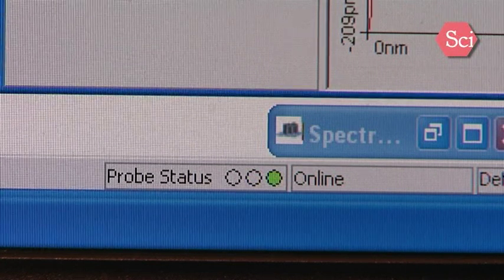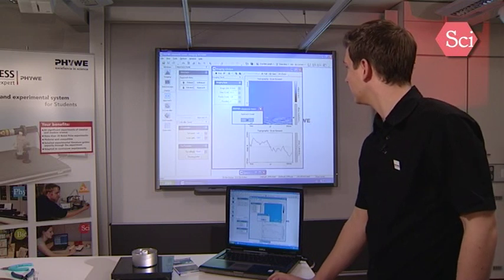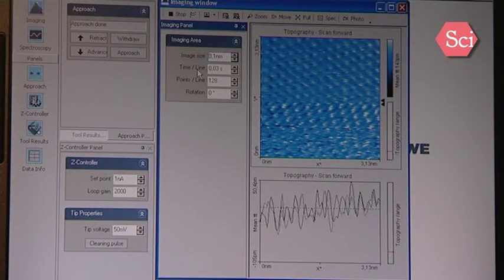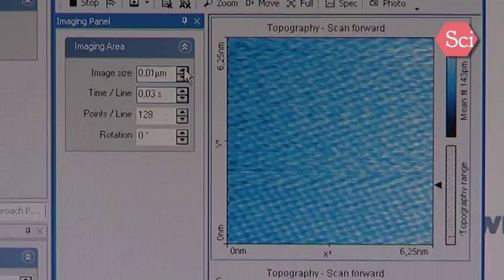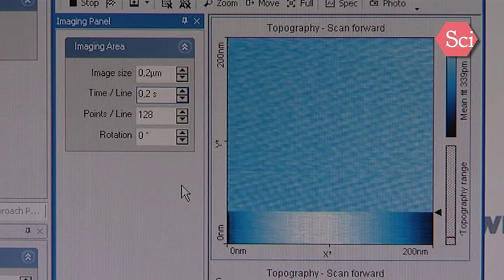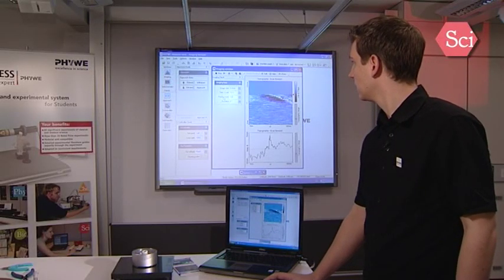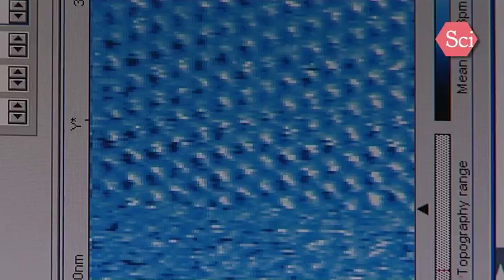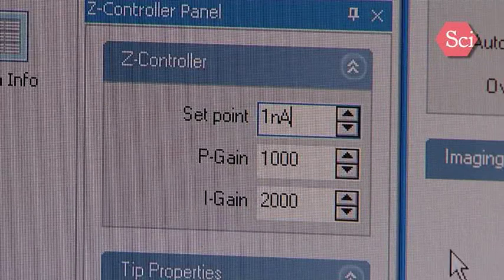Now the approach procedure is done and we can start our measurement. Confirm the dialog by pressing OK. We now see the sample surface scanned in the imaging window. You can adjust the image size, the scan speed, and the resolution the image is taken with. Now we see the sample surface. To adjust the tunneling current flowing between sample and the tip, you can use the set controller panel to adjust the set point and the loop gain.